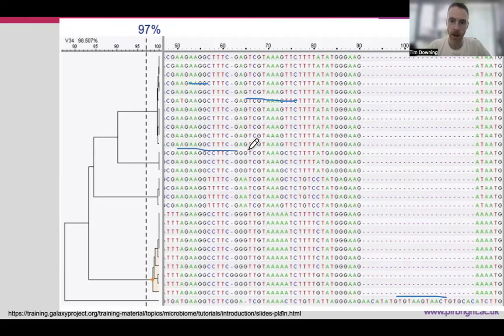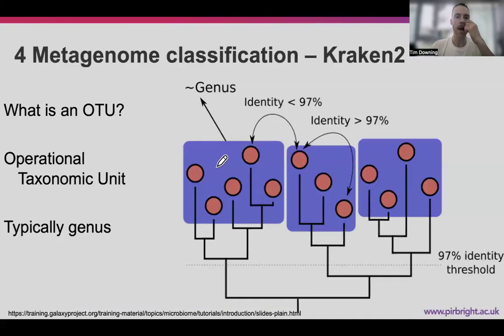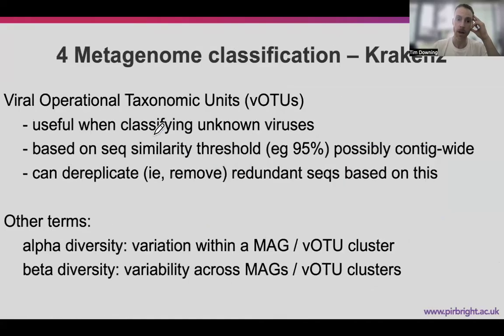So you can see here, these three here have some nucleotide difference compared to the ones before, like at this A site here, and there's other examples as well elsewhere, like the C's here. So this works well for bacteria, but less well for looking at viruses.